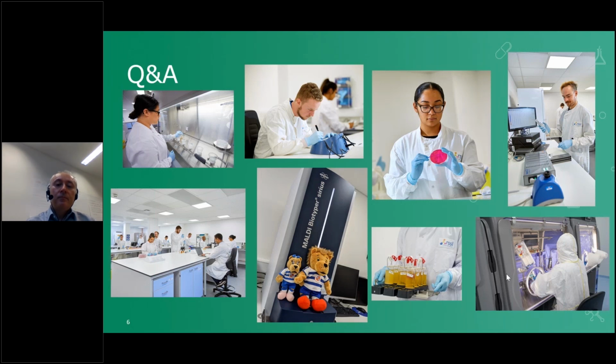Okay, and I've got a question from Eva about what is the frequency of gas monitoring when in routine. So I think it means in routine status. Okay, I guess that means compressed gases. So there, one depends on whether it's going through a sterile filter or not.